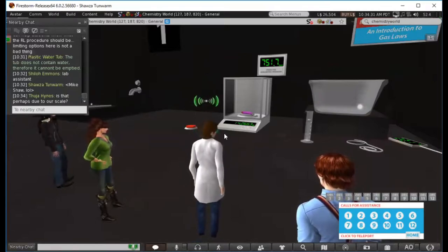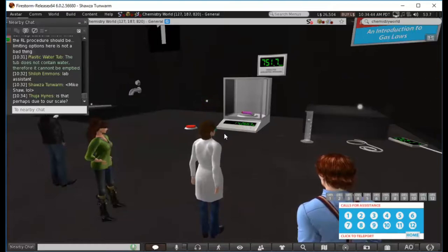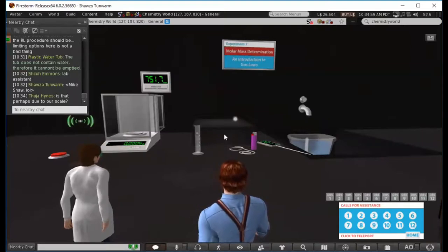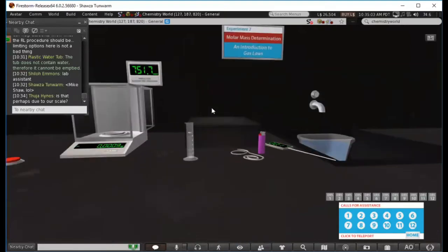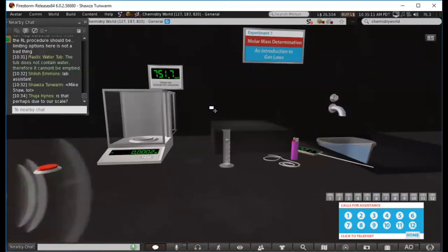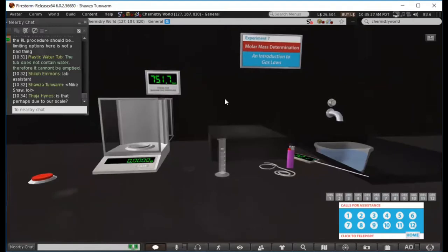So now, if you want to play around with this again, well, actually, let me go through and show you what the students had to do, because this is kind of a clever little thing. First, you fill the tub with water. Then we're going to need to get our lighter. We need to remove the lighter. The students would have recorded the mass of their lighter, and they would have had to do that themselves. The virtual lab didn't record anything for them. Although in the background the lab did run a calculation. It knows what the mass of the lighter was. If the students write down the wrong number, that's going to show up as an error in the results.